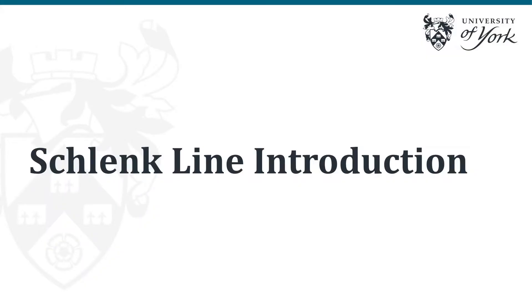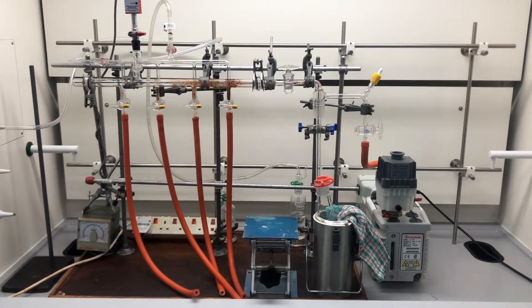Hi guys, this is just a brief introduction to the Schlenk line. I'm going to be outlining the main parts that make it up and what they look like.